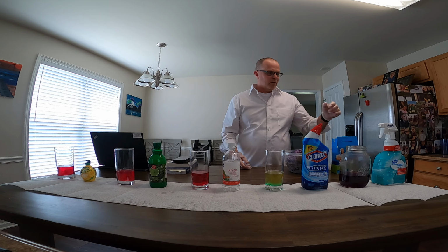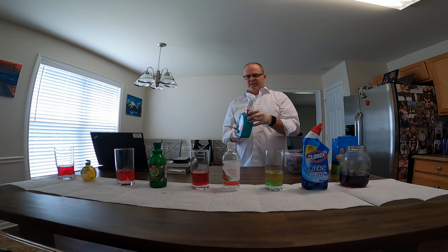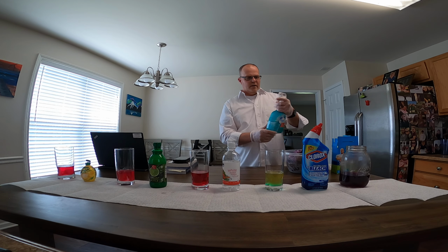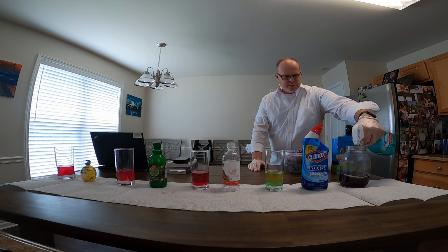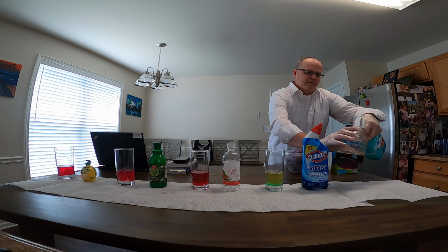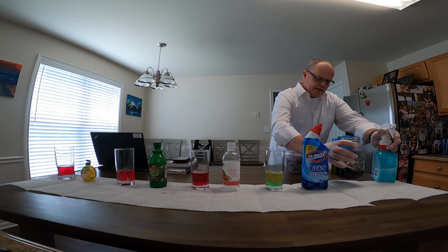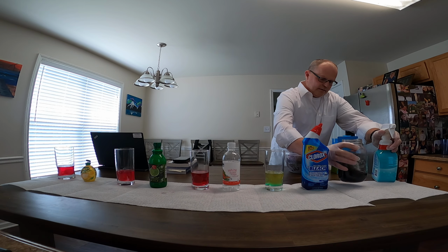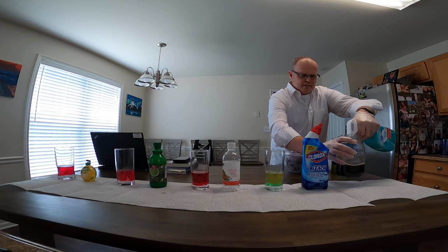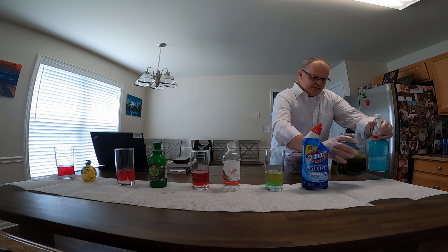So, one last household chemical. The toilet bowl cleaner also has bleach in it, and this is a bleach spray that you would use for sanitizing your home. Let's see here. All right. Not having much of a color change, so we'll just add some more and see if we can get it to change.